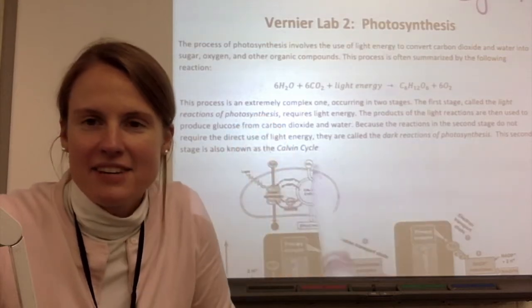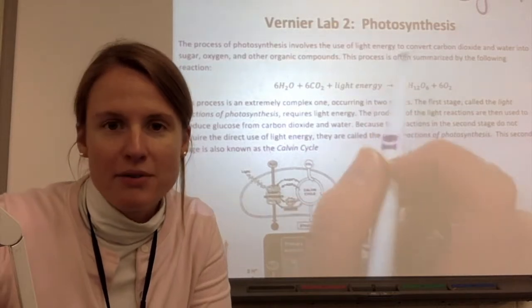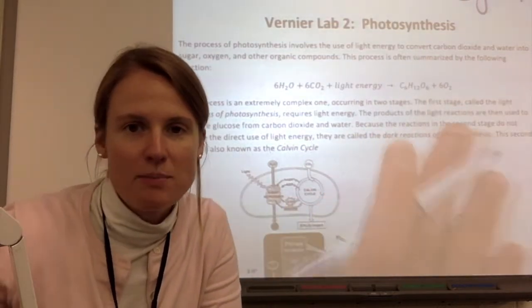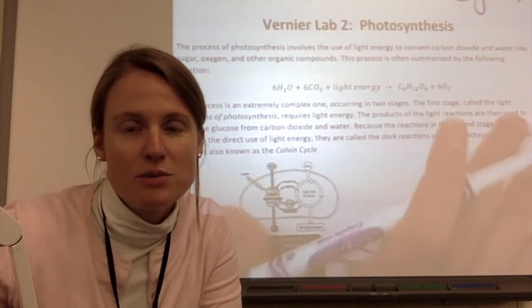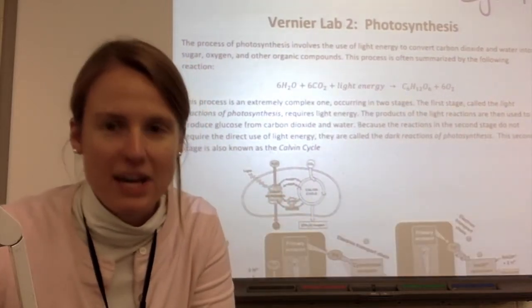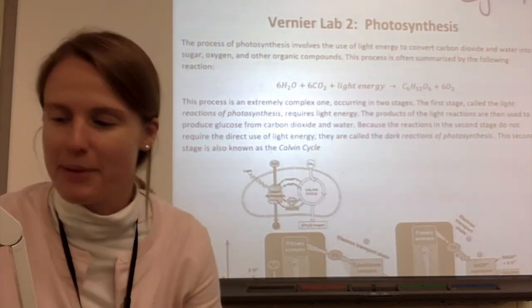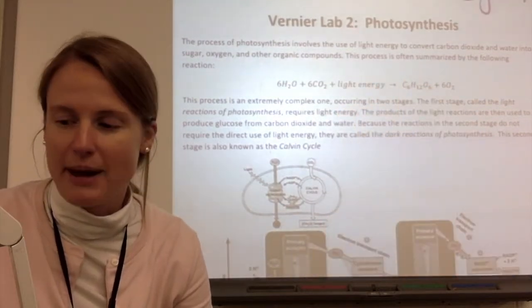Hi guys, this video is for Hinton students in preparation for lab number 2 about photosynthesis. Tomorrow, Wednesday, in class, you can pick up one of these lab protocols from the front table. If you want to pause this video and continue watching it once you have a protocol in your hand, cool. If you'd rather just watch it now, feel free. As long as you've finished watching it by the time you get to Hinton on Thursday, you're in good shape. So I'm just going to go through the protocol to give you a sense of what to expect.